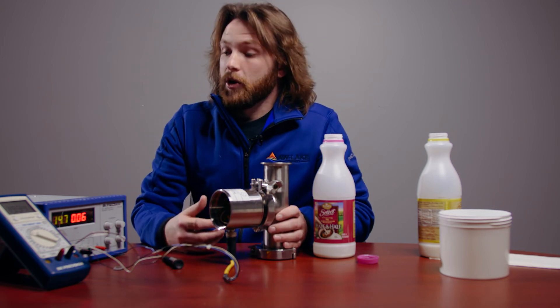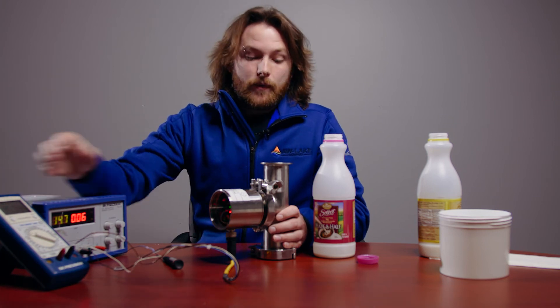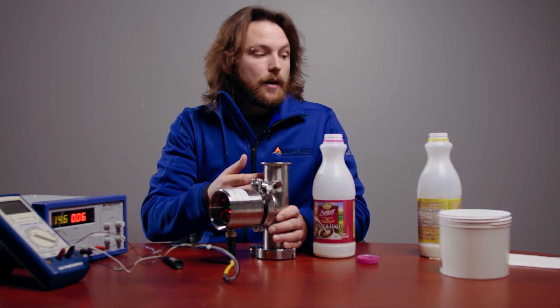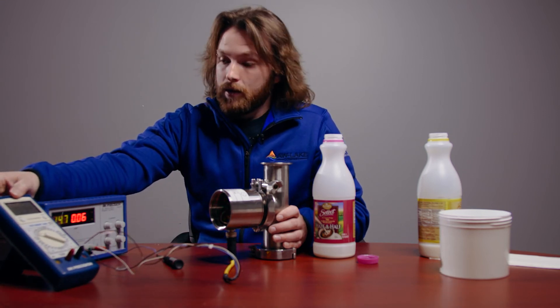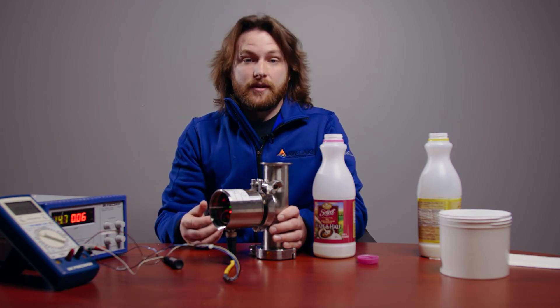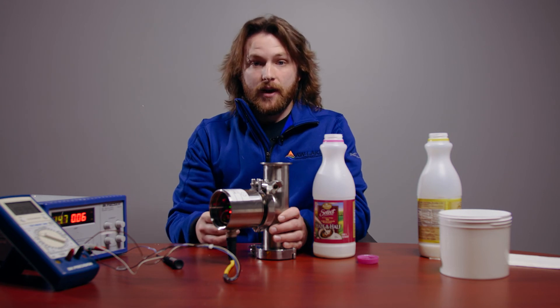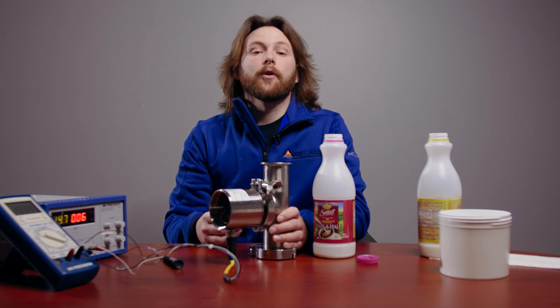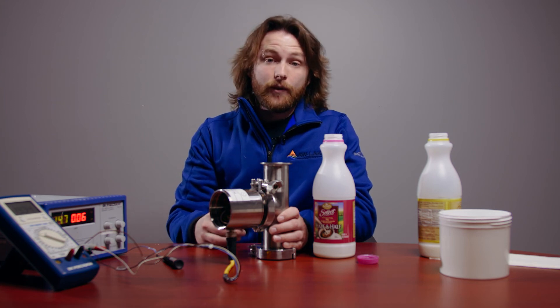In order to check your calibration, you can use your multimeter. You can pour this sample out, pour another sample in, and see the corresponding milliamp output. Your ProScan is calibrated and you can put it in your system. If you have any questions about calibrating your ProScan, you can always call us or go to our website, awlake.com. I hope this video was helpful, and have a wonderful day.